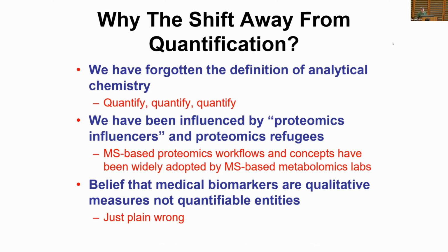Two, I think we have been influenced by what I'll call proteomics influencers or proteomics refugees. So in the field of mass spec-based proteomics, the workflows were largely adapted from those fields into metabolomics. And you can find many people who previously worked in proteomics labs have simply adopted the same software, the same concepts, the same tools to apply to metabolomics.